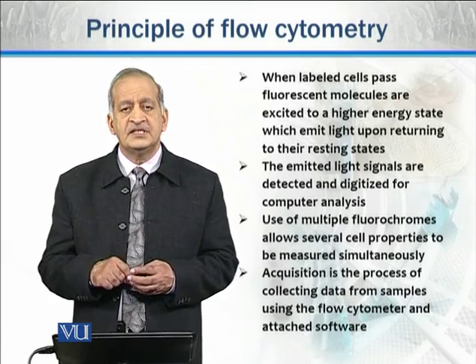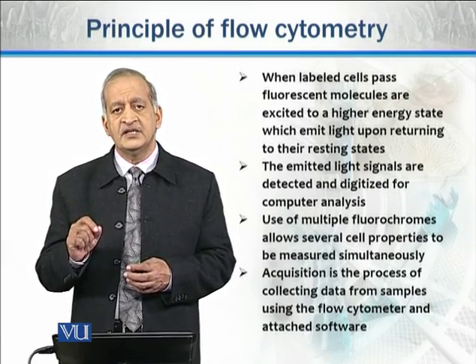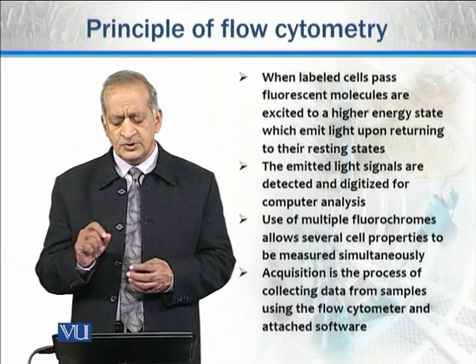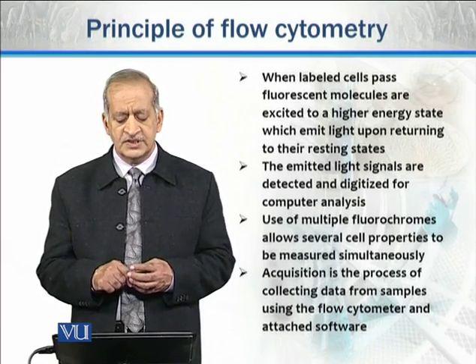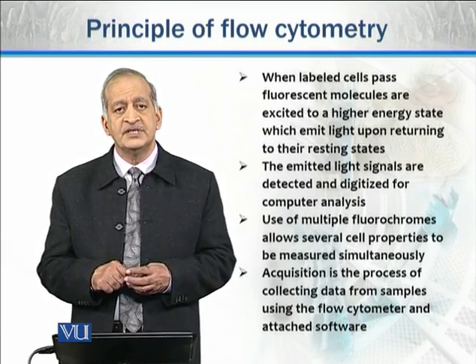These emitted light signals are detected and then digitized for computer analysis. Use of multiple fluorochromes allows several cell properties to be measured simultaneously.